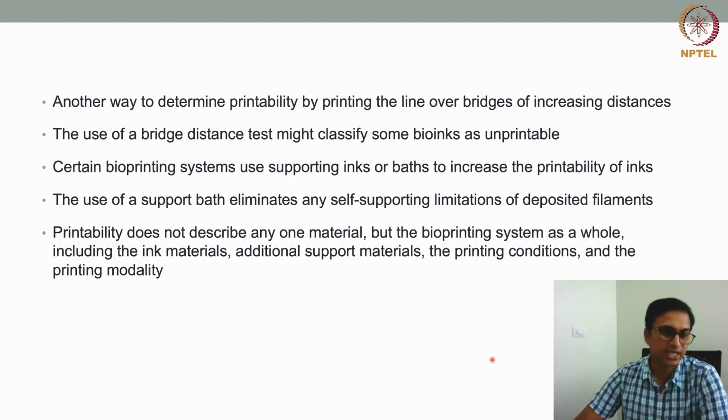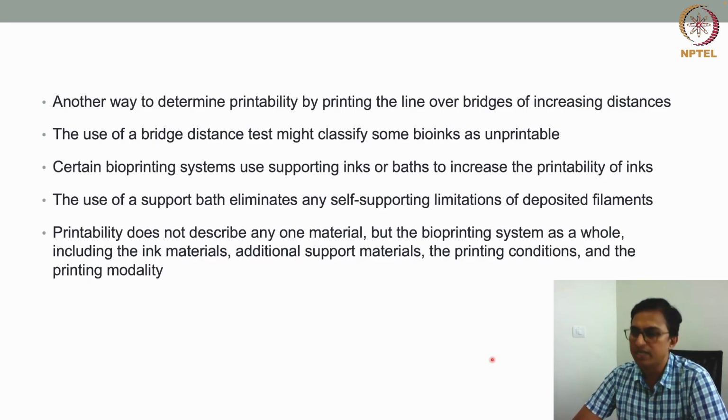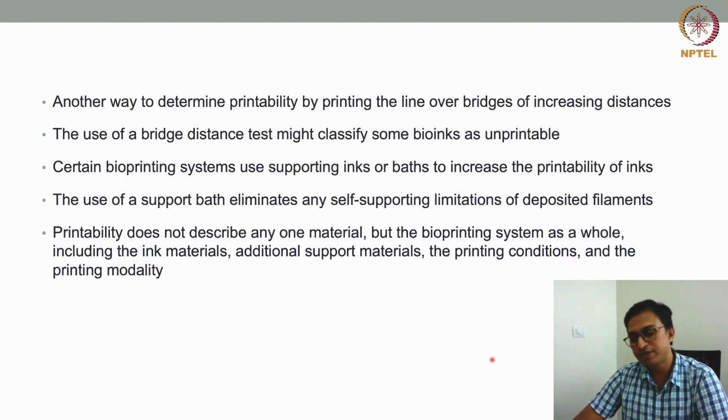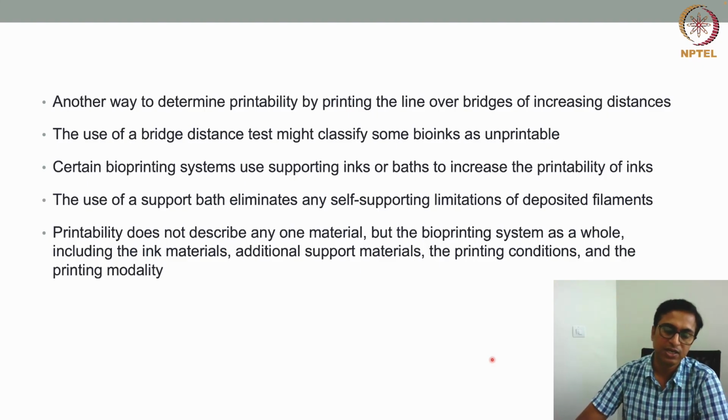All these things together can describe a material as printable or non-printable. We have clearly seen in the earlier example that a bioink can be very well printable in a support bath, but unprintable in a conventional bioprinting where we are trying to print on a petri plate or a glass slide.